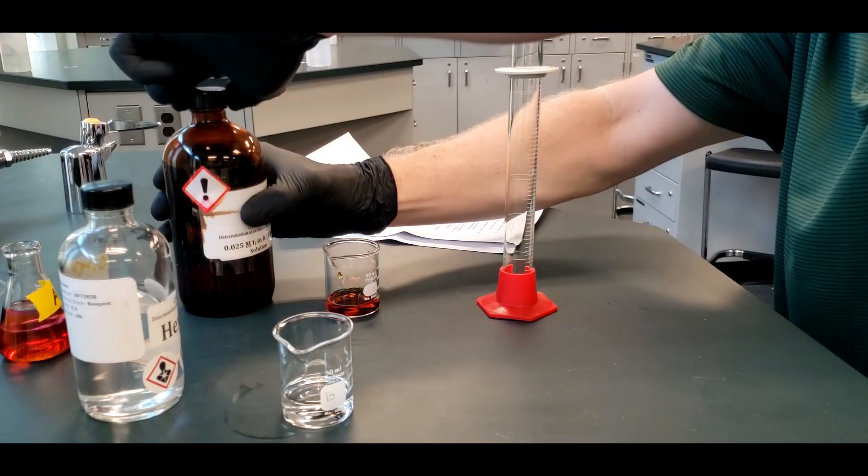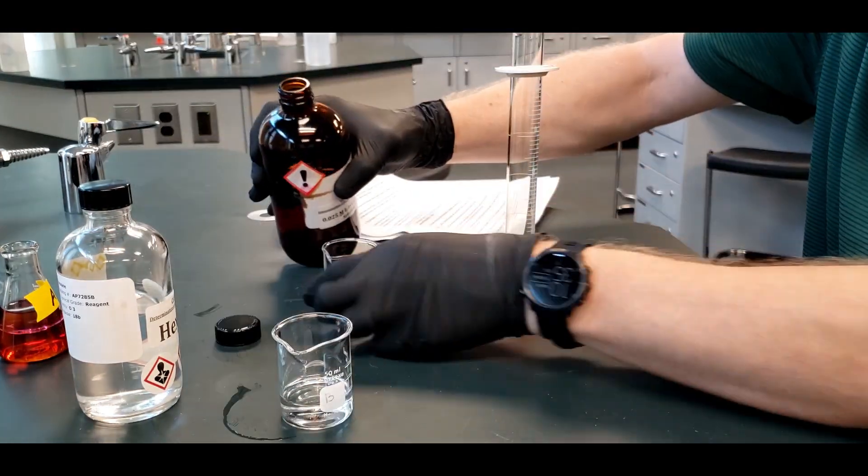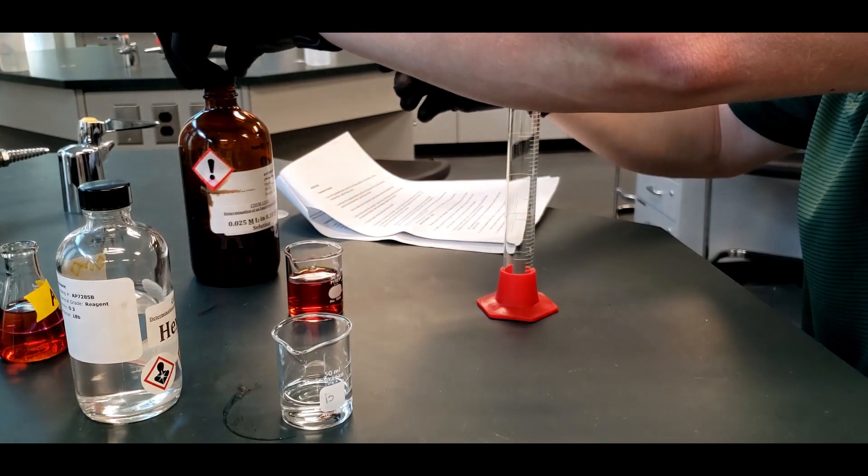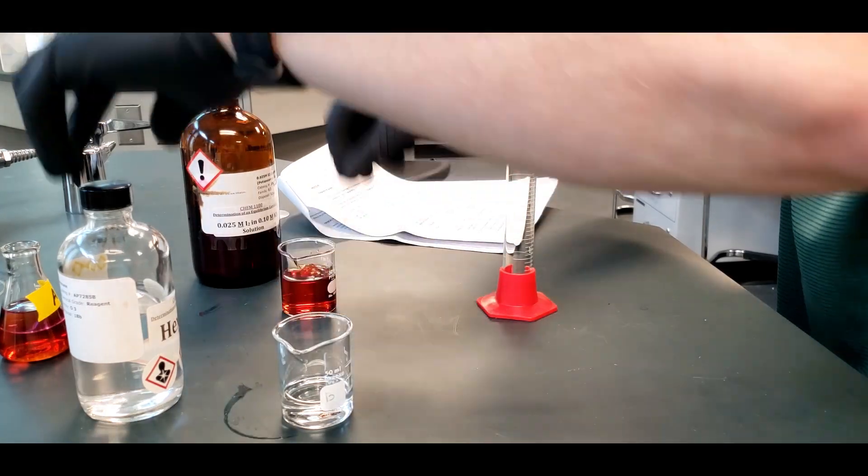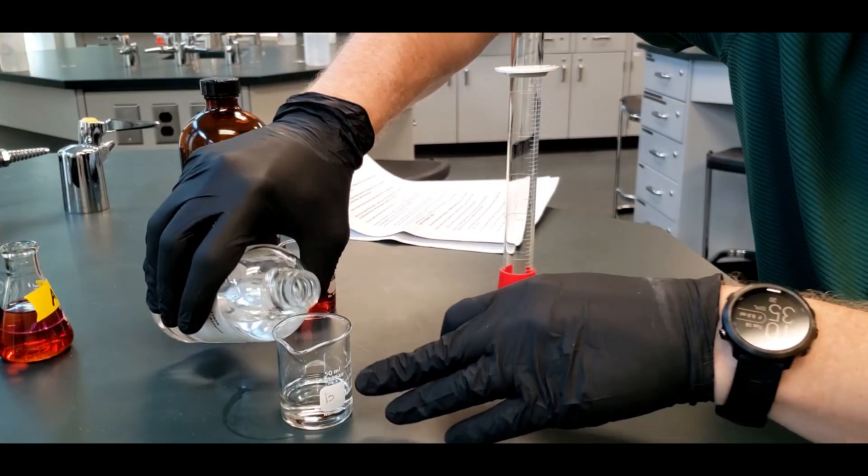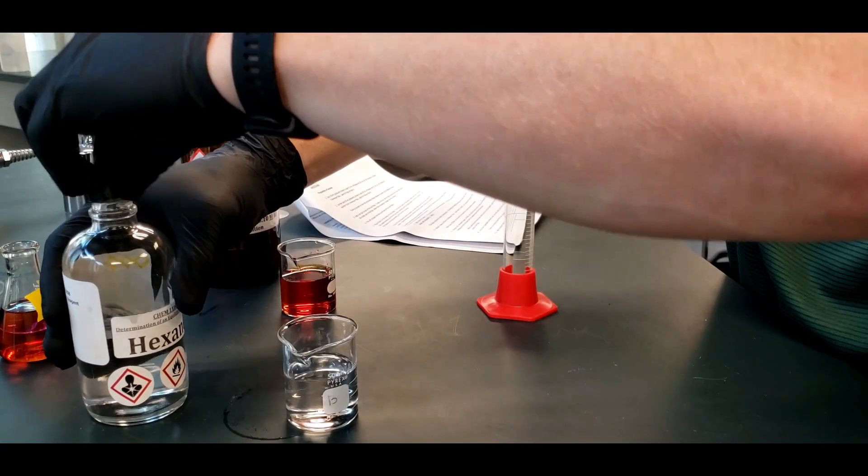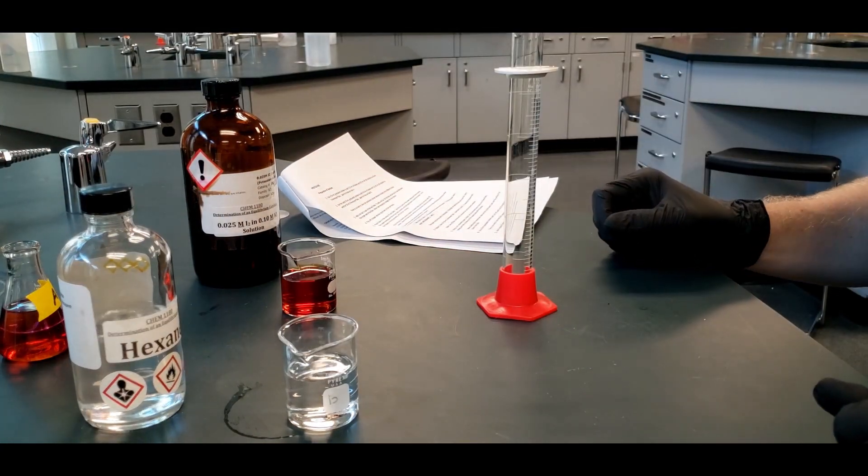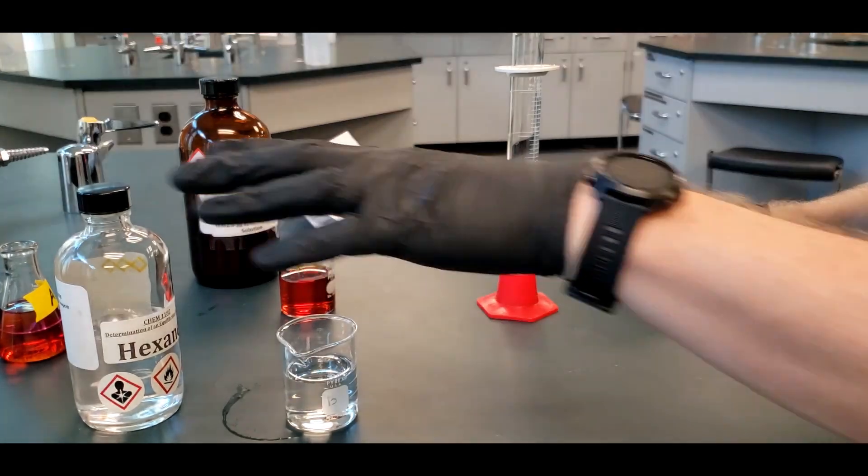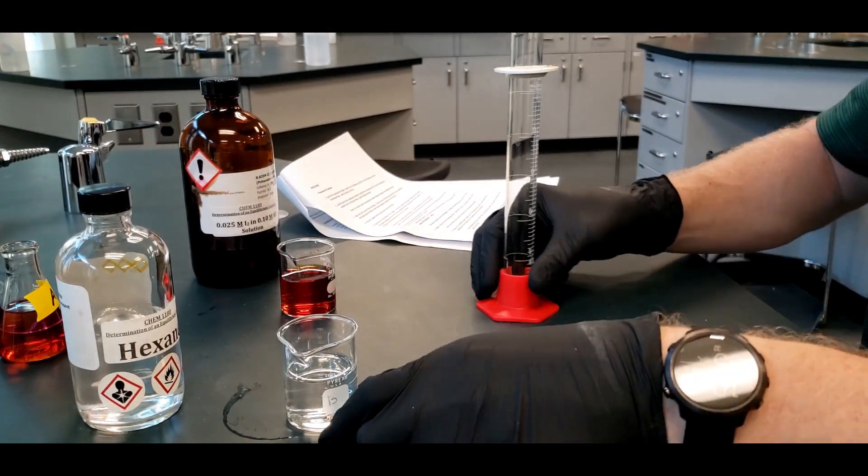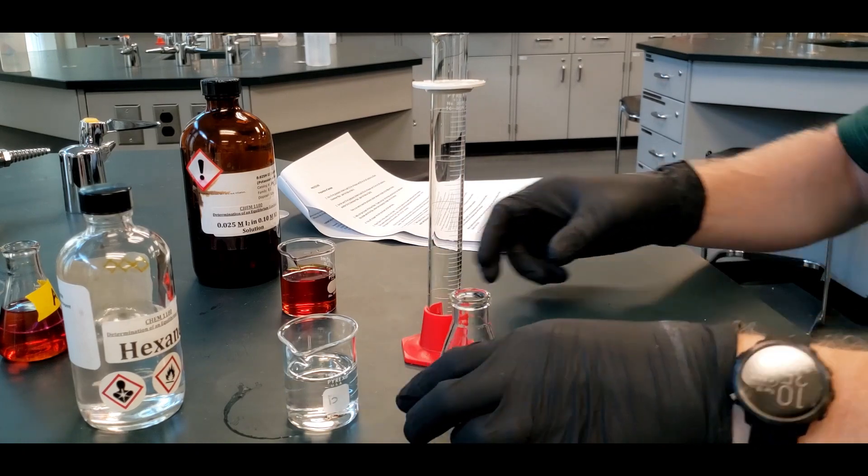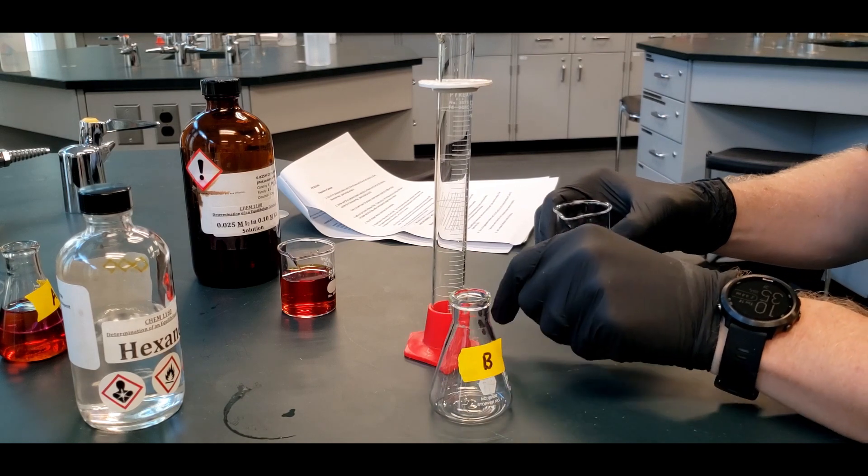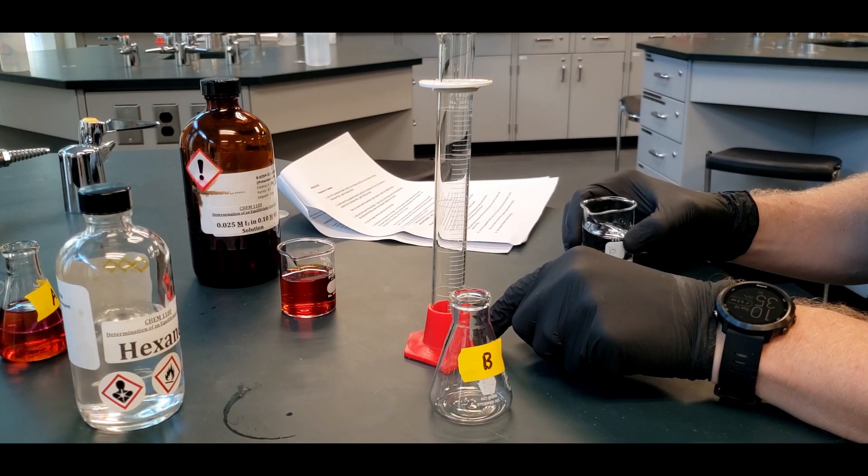Put this over here, and we'll pour out a bit more of the iodine iodide, and then I suspect we need some hexane as well. So we did 15 mL of the hexane, 30 mL of the iodine potassium iodide, and now we're going to do 30 and 15.